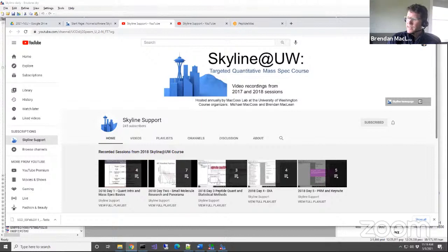From yesterday's Skyline batch run, I got the following error: Error in Skyline MStats format. Have multiple conditions or bioreplicate. Please help. Thanks. Okay, something must have been wrong in one of the settings, but I think we'll have to defer to Mina. We'll be back to work with you on that one.